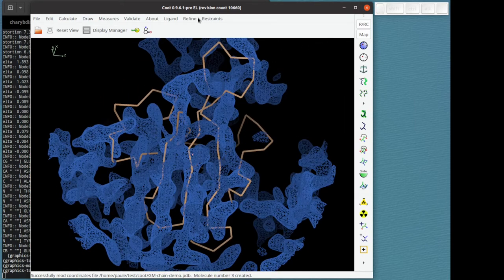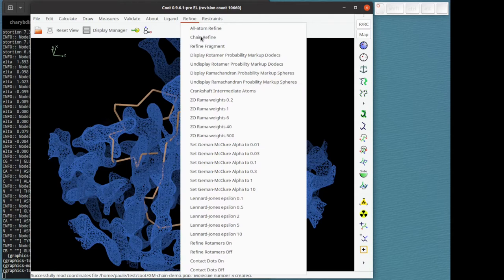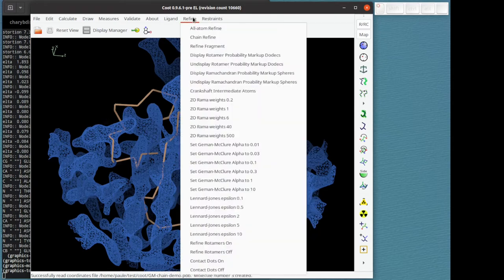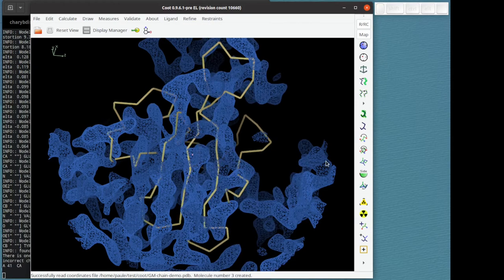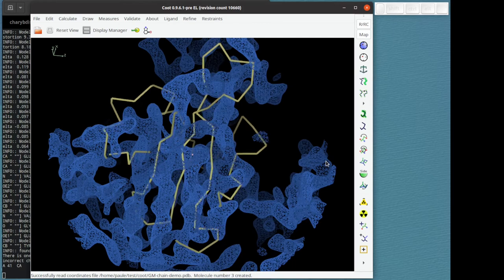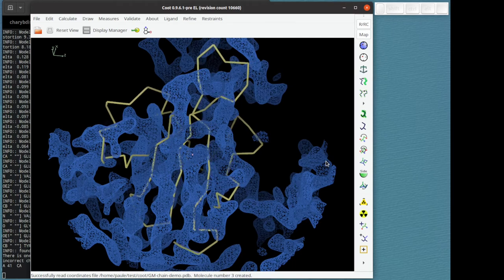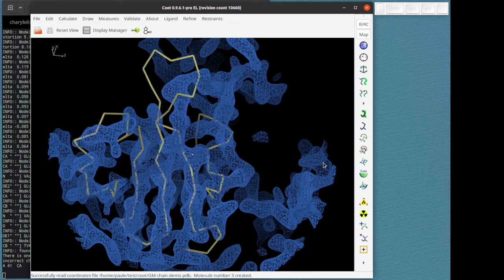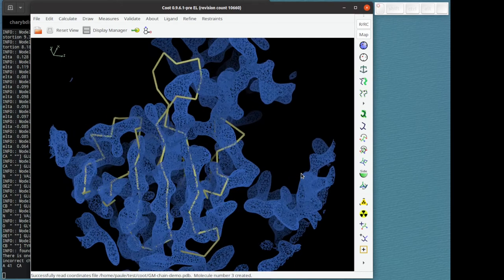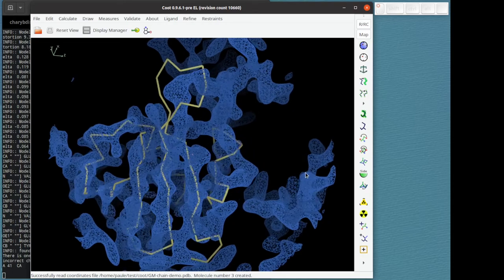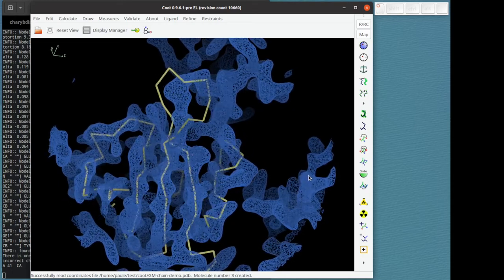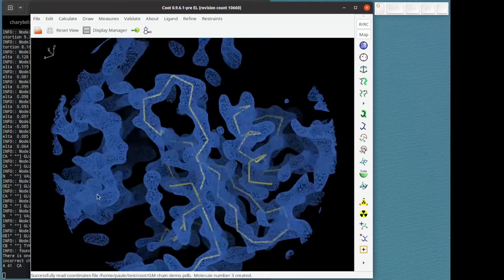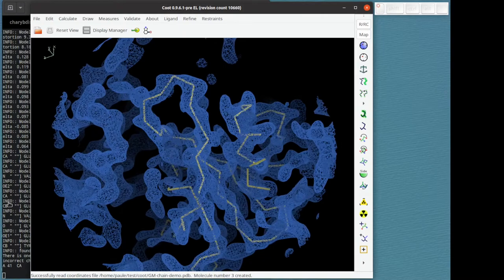Next we are going to set the weight. So I'm going to choose 0.1. You might like to try other values later. And with that in place we can do refine chain refine. And there it goes. It found the right solution.